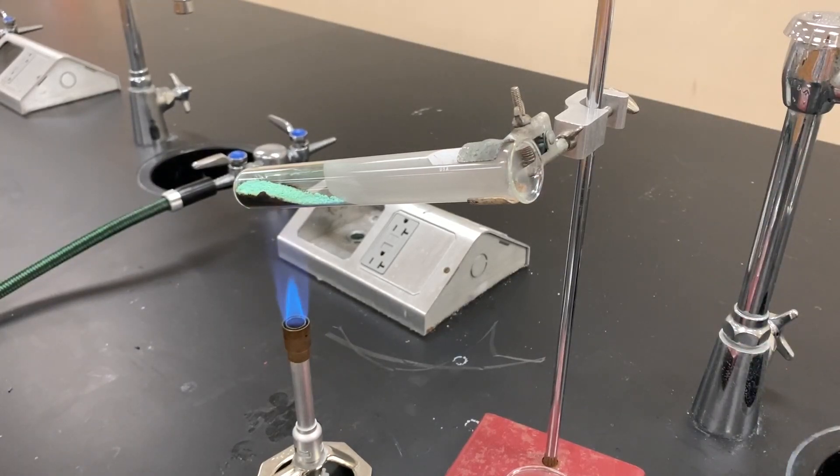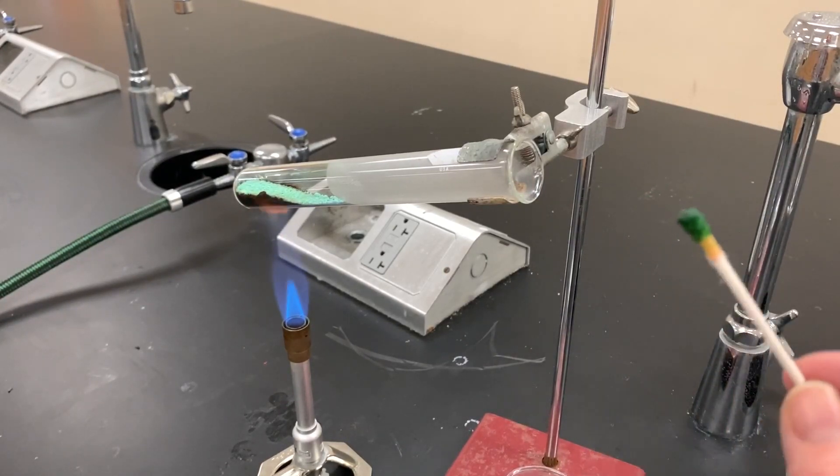The second test you can do is using universal indicator. It starts out green. Keep universal indicator away from a flame because the liquid is flammable. I just soaked a little bit on the end of a Q-tip and it's green.